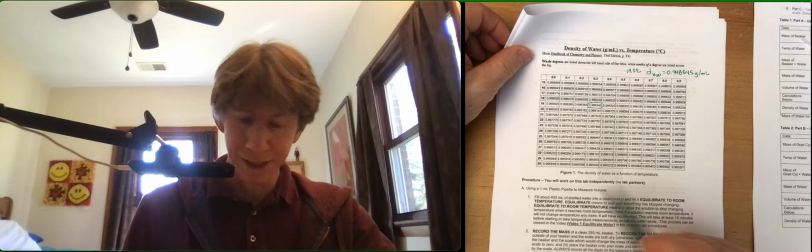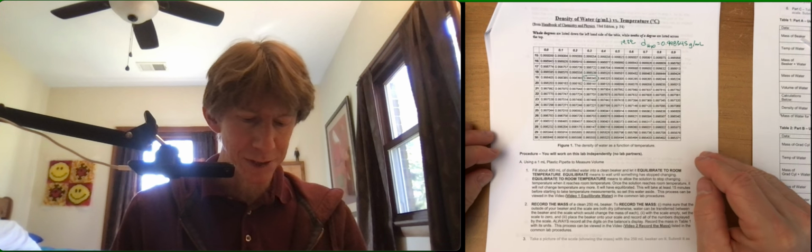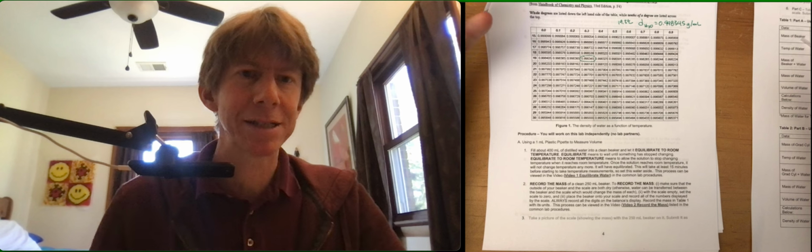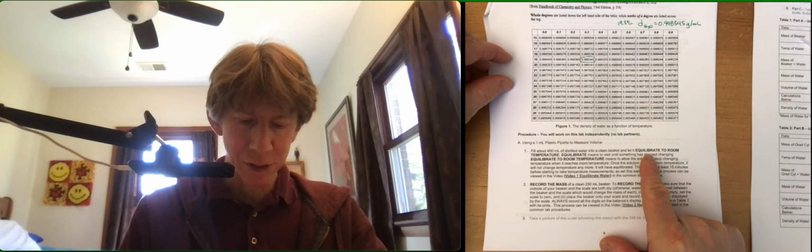You'll work independently on this lab, no lab partners, since you're doing it at home. I guess that's true. Using a 1 milliliter plastic pipette to measure volume. The thing that I find is the most helpful is to just read over it, follow the directions. We'll do that together. Fill about 400 milliliters of distilled water into a clean beaker and let it equilibrate to room temperature. Equilibrate means to wait until something has stopped changing.